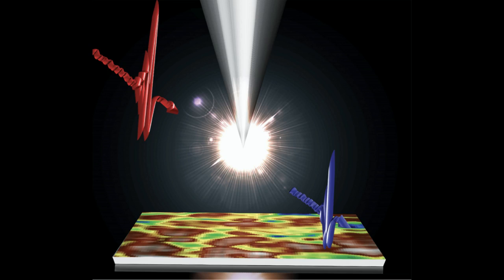The researchers believe that the present study demonstrates a powerful microscopic tool to visualize, understand, and potentially mitigate grain boundary degradation, defect traps, and materials degradation. Better understanding of these issues may enable developing highly efficient perovskite-based photovoltaic devices for many years to come.